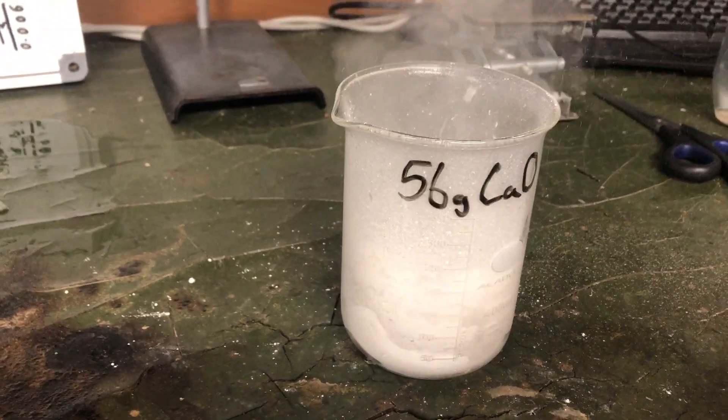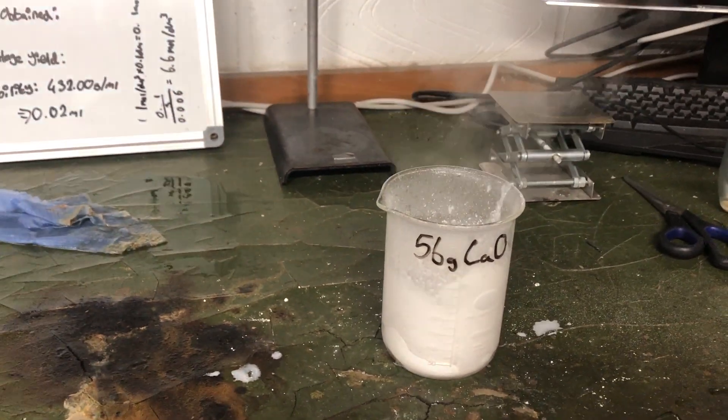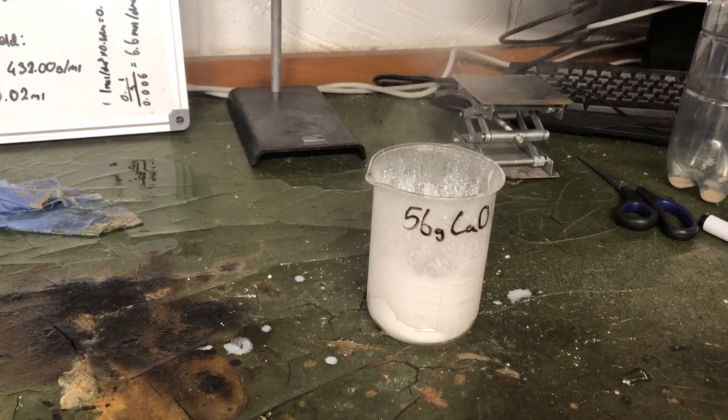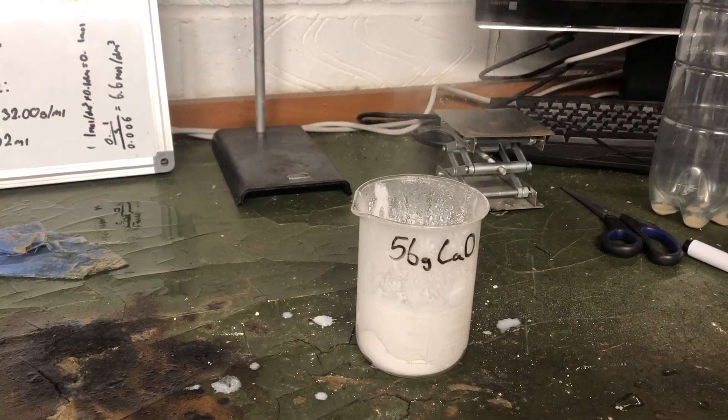Wow. It's spraying absolutely everywhere. There's still like 20 millilitres left.